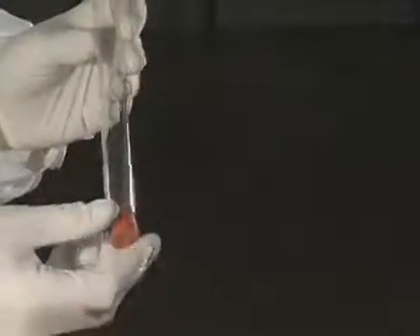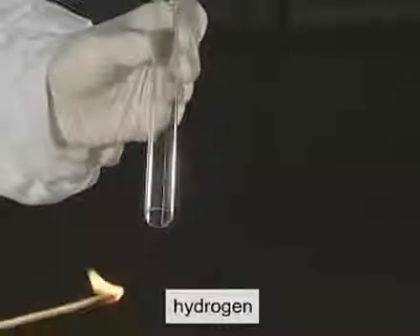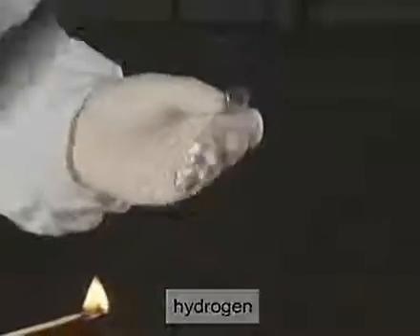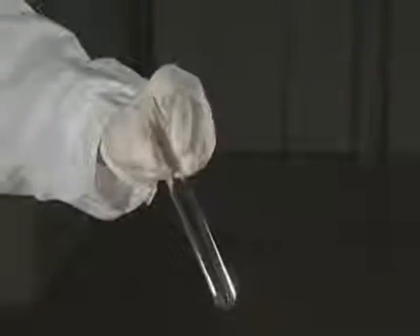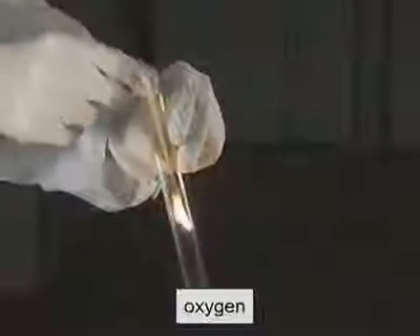The characteristic cracking sound proves that the gas released at the cathode is hydrogen. The ignition of the glowing splint is evidence that the gas collected from the anode is oxygen, which supports combustion.